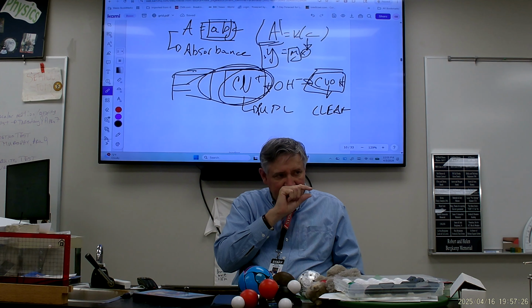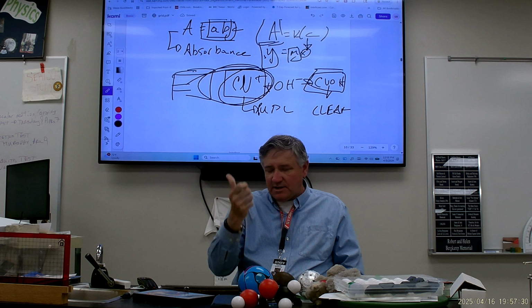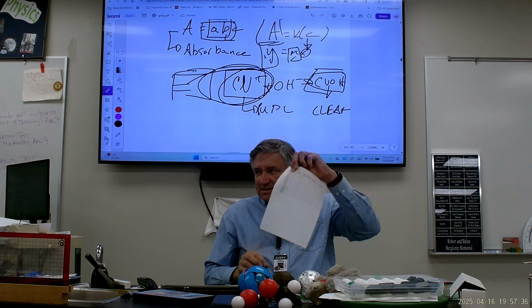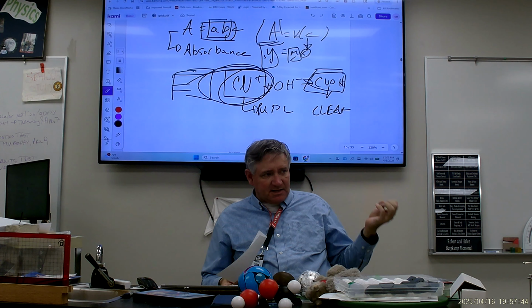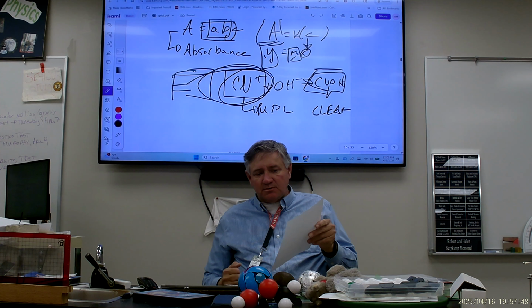You're going to put that cuvette into the colorimeter and close the lid. As soon as you close the lid, start the clock. Every 30 seconds, you are going to measure the absorbance, and you're going to do that for a total of 300 seconds, all right? So you go dink, dink, dink, and you measure that absorbance.